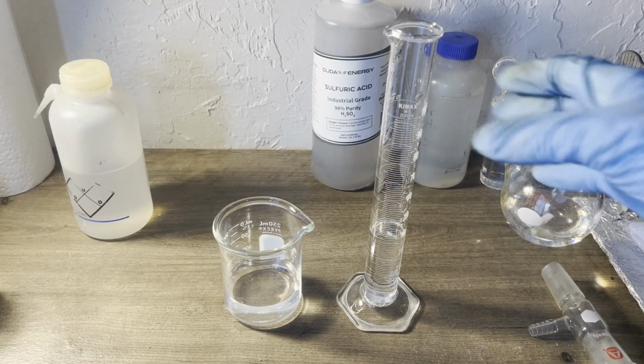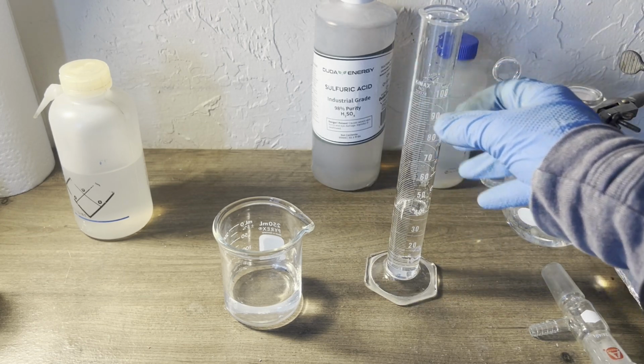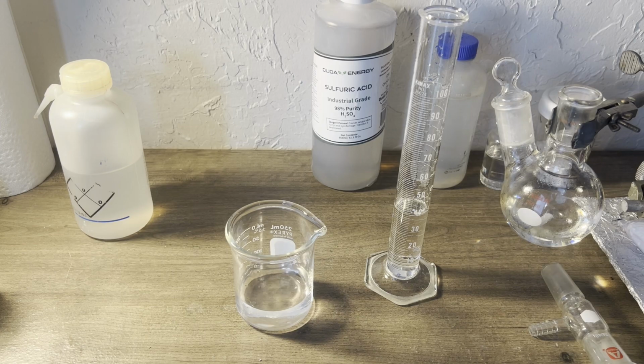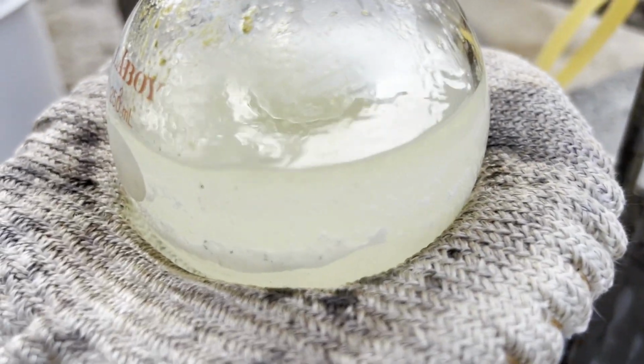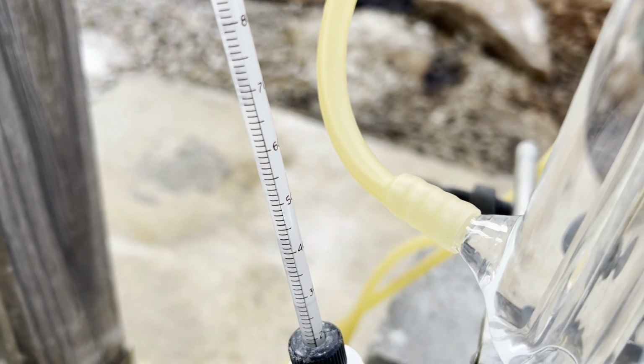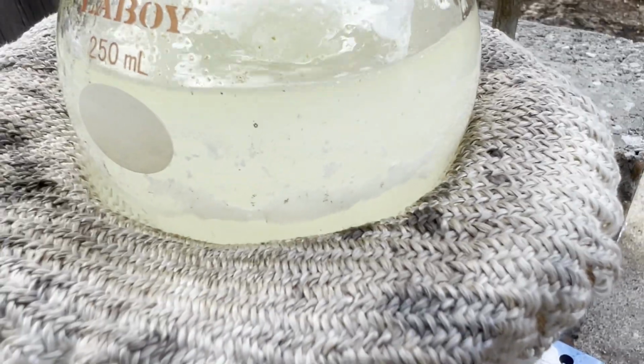Onto the TCCA sulfuric acid run. I assumed it was 50% sulfuric acid by weight, so I mixed 70 milliliters of water with 39 milliliters of concentrated sulfuric acid. I assume it's 98%, that's why I used 39 milliliters. I added the distillate from the previous runs to the diluted sulfuric acid and then added the TCCA.